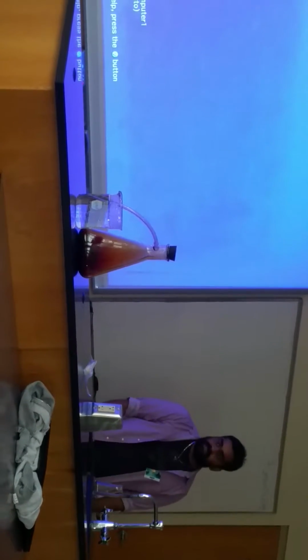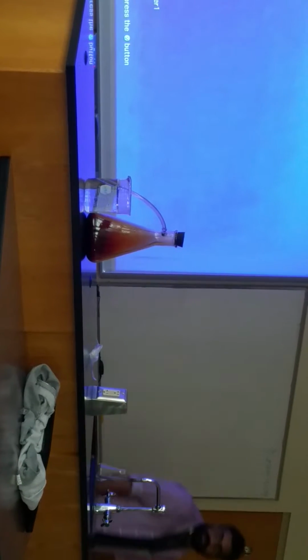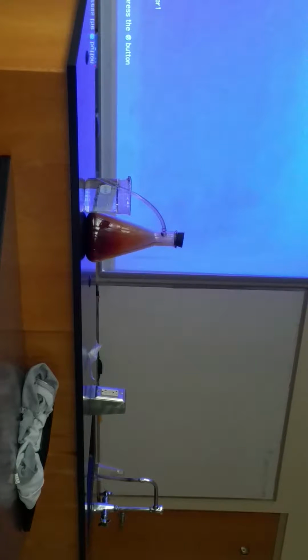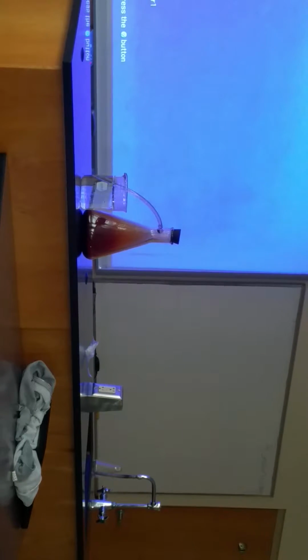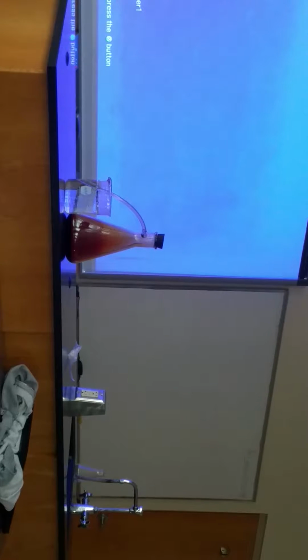So what you see now, this red fume, that's the NO2. Oh, solid. You see water is being sucked back now, right? Wait till, it's a beautiful reaction, but it's just so dangerous that, well, good things in life are dangerous. Or really risky.